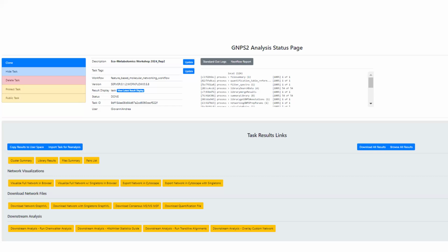How can you prove that these metabolites come from that kind of environment and that they are produced there? We got metabolites from the subsurface samples which do not have any role in the deep subsurface, so maybe it's contamination during processing, because we know deep subsurface samples are very low in biomass.